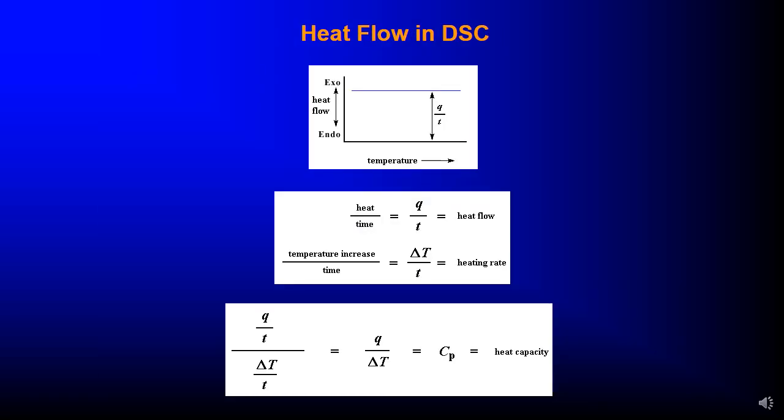So heat flow in differential scanning calorimetry, as you can see, endothermic and exothermic, and remember that temperature is being held constant and then increased linearly.